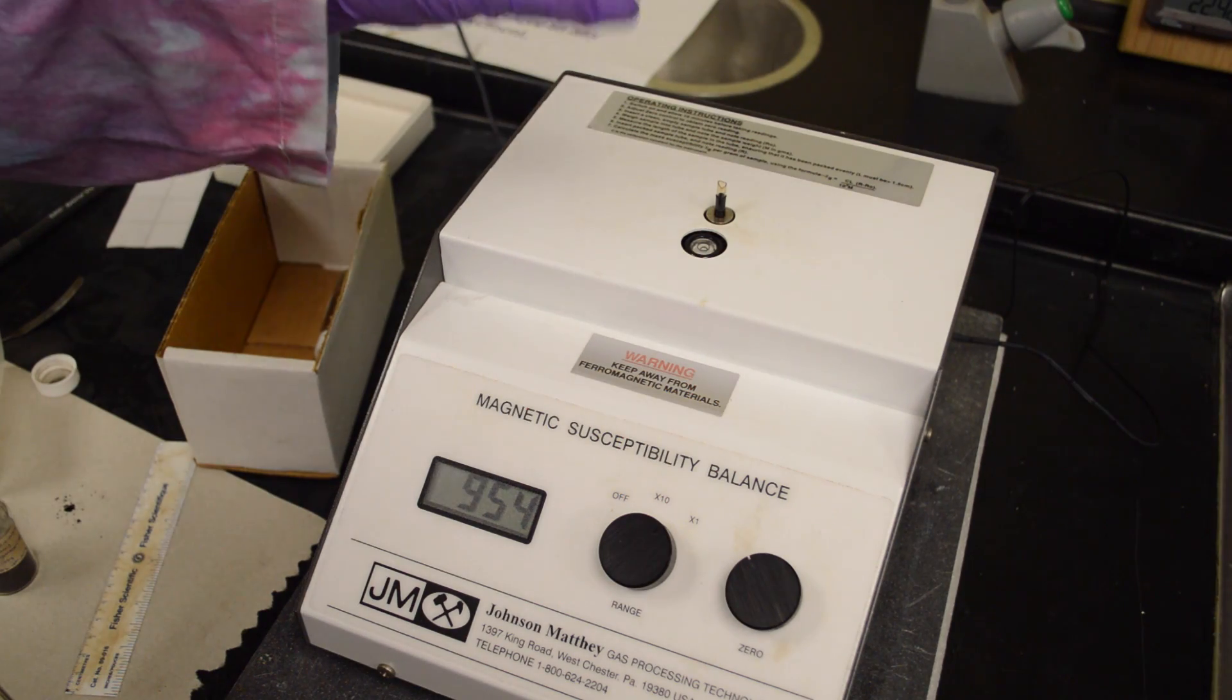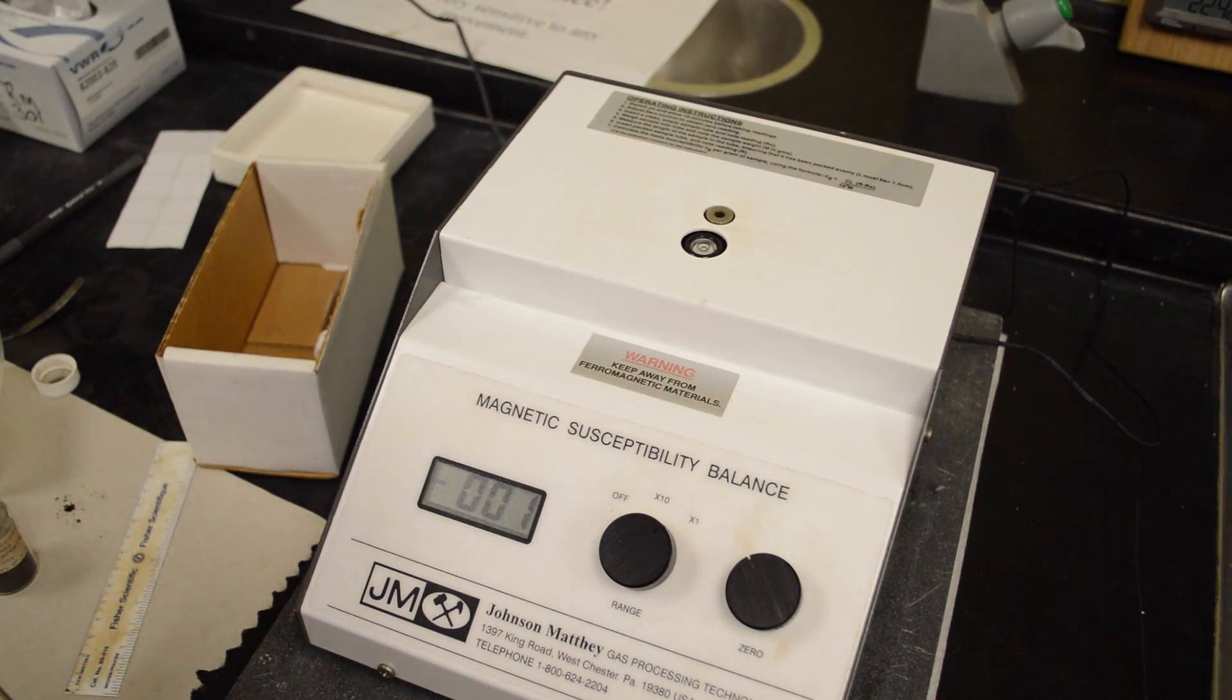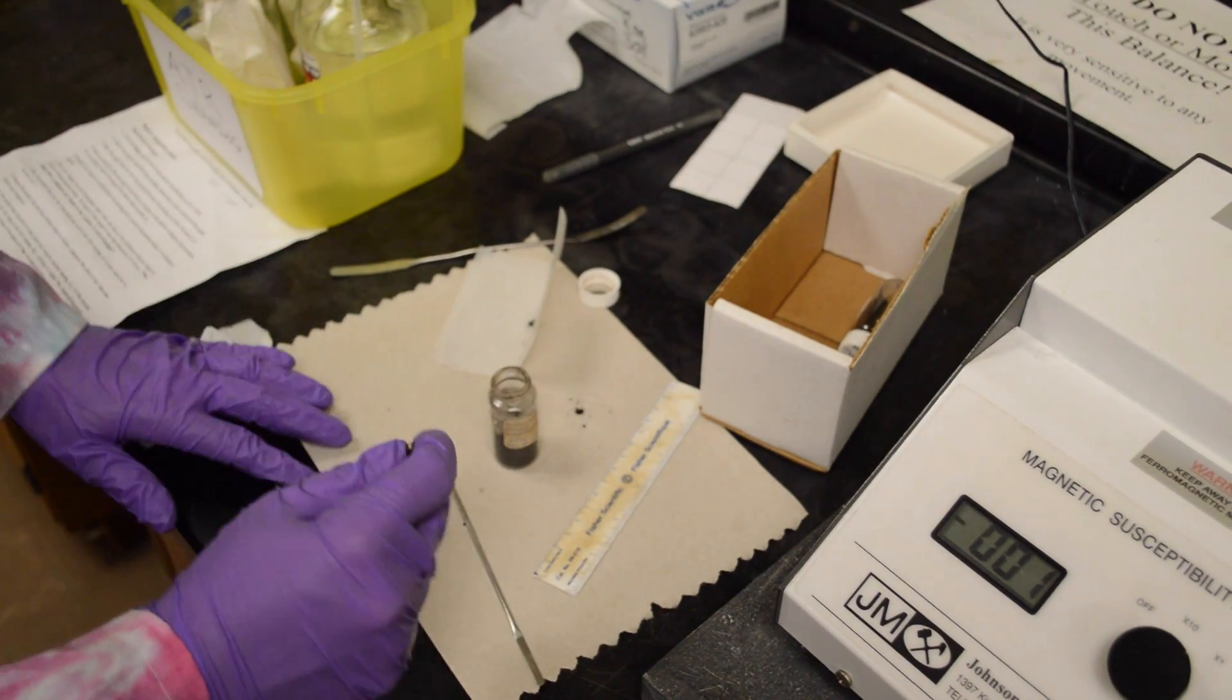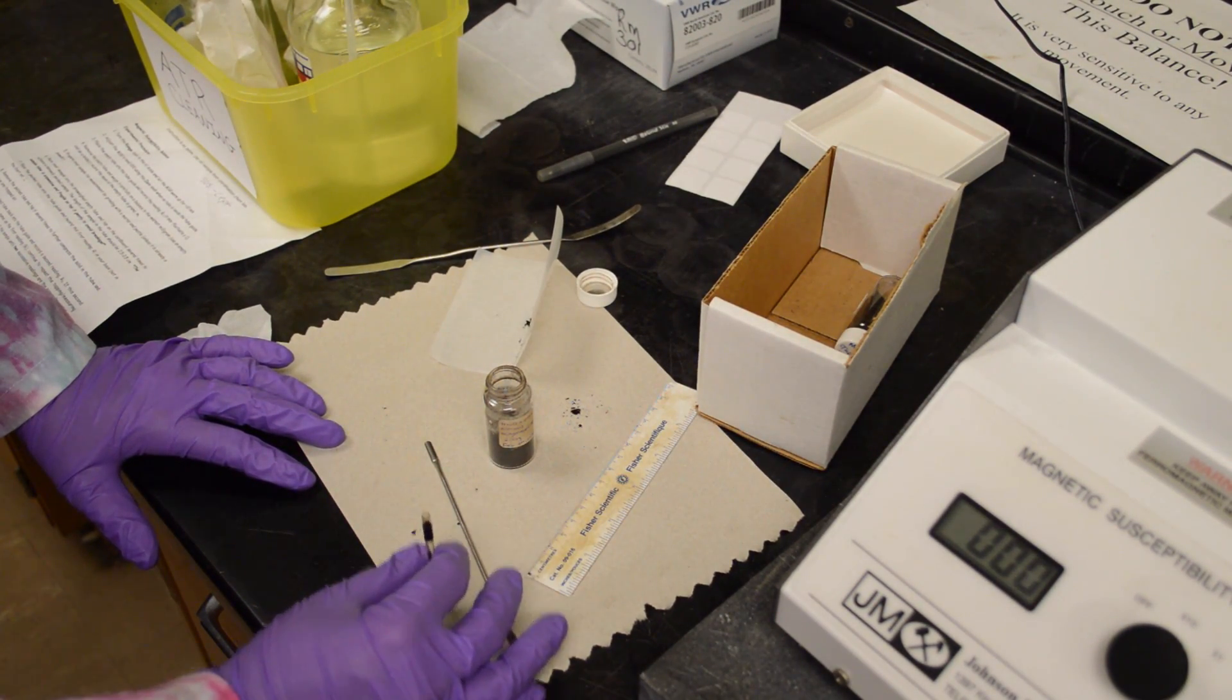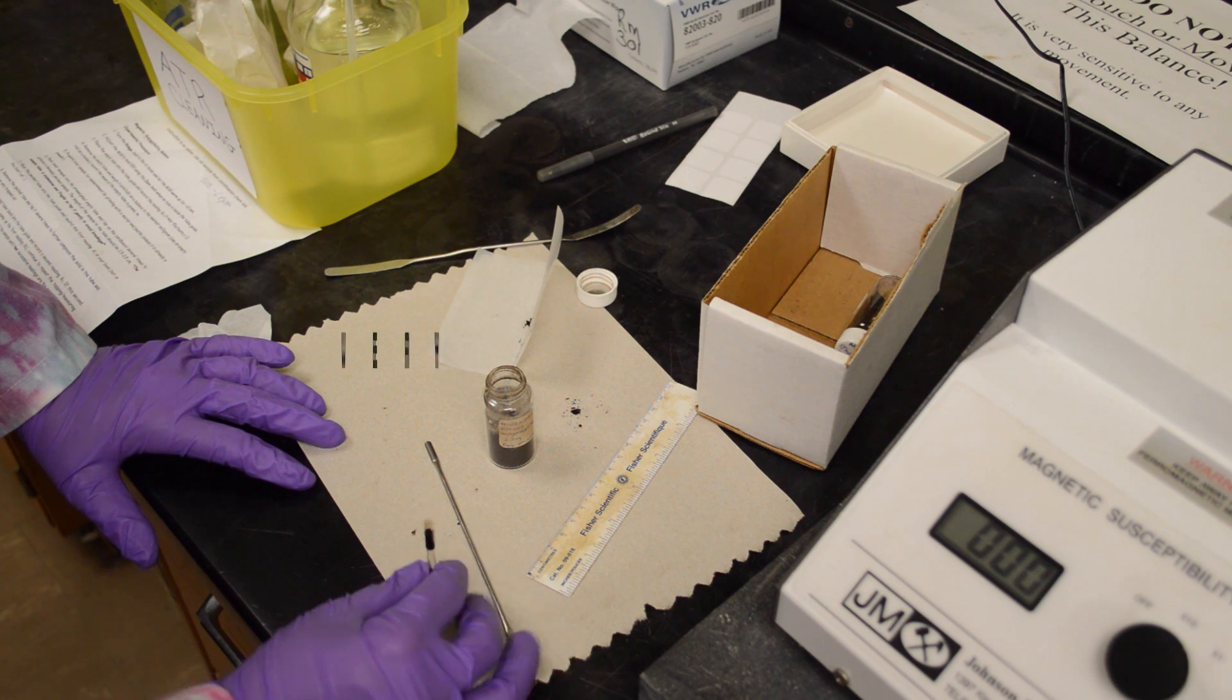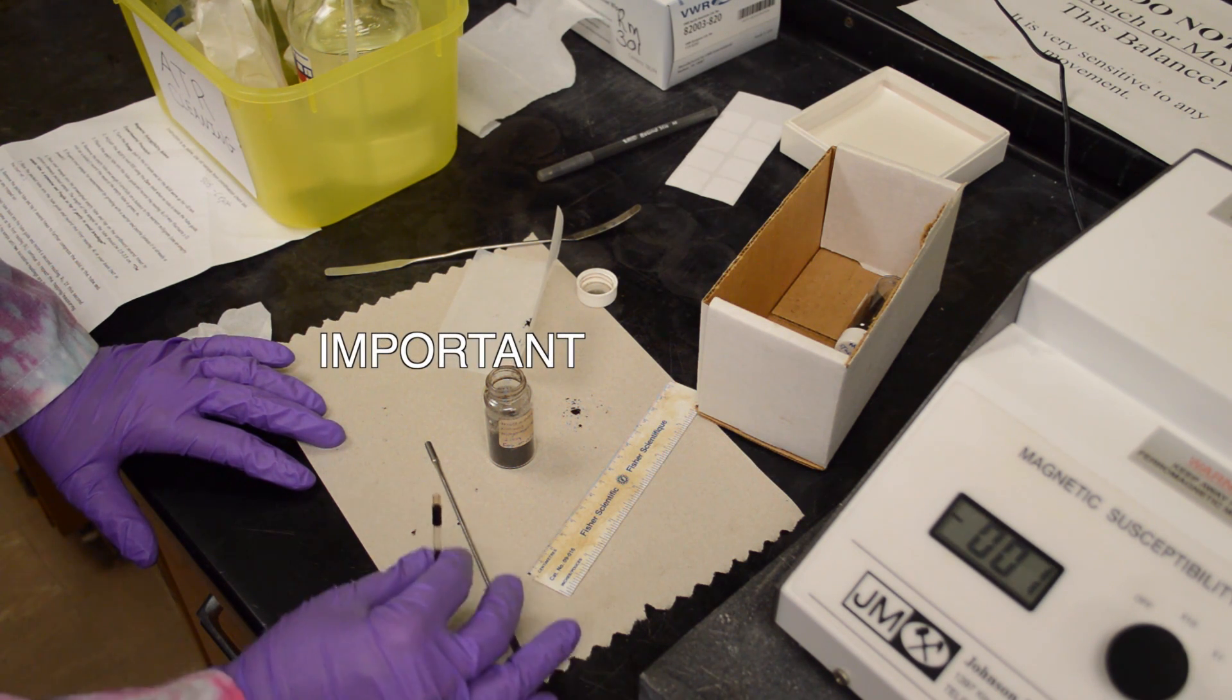Remove the tube once you have the initial reading and compact it against the bench until it is more compact. Then insert the tube back into the balance to make sure that you have the same reading. Once you have the same reading, you can go on to the next step.